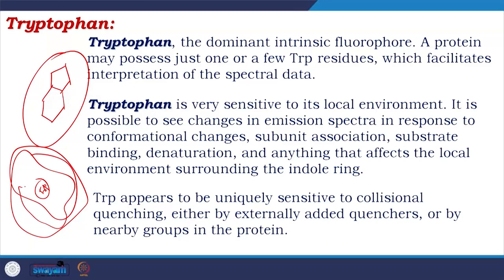And depending on that, if you are lucky enough to have one tryptophan, you could even calculate quantitative rates. It is also possible for ligand binding and anything which changes the conformation of the protein. Tryptophan appears to be uniquely sensitive to collisional quenching, either by an externally added quencher or by nearby groups in the protein.